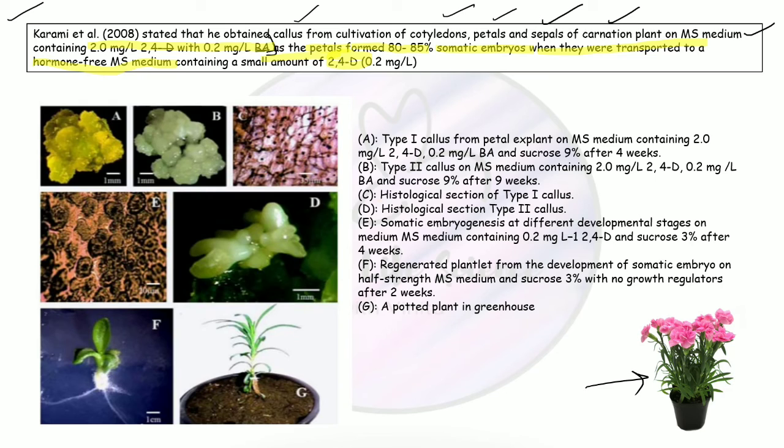The only difference is that here we use the somatic cells of the plant. In vitro, in the presence of certain phytohormones, you will prepare embryo-like structures named embryoids, and you can induce these embryoids for the regeneration of entire plantlets. They function in a very similar way as zygotic embryos.